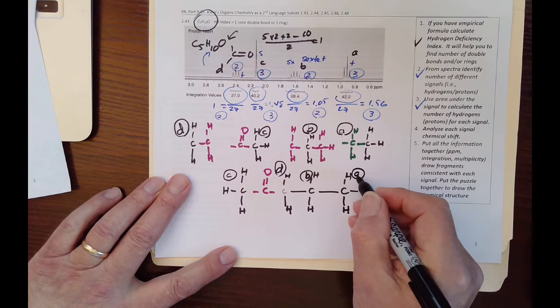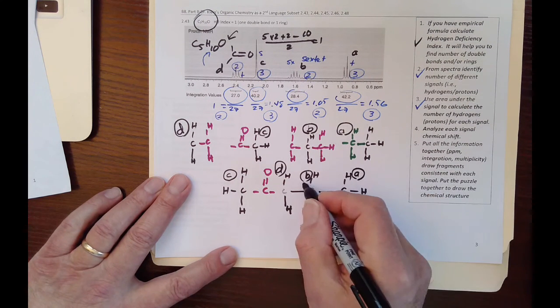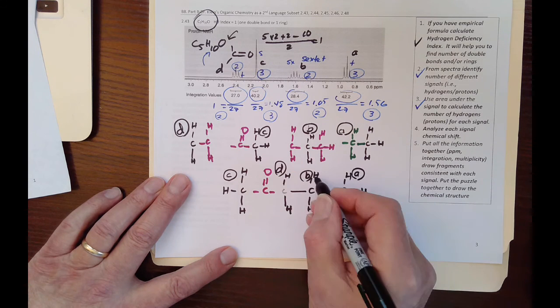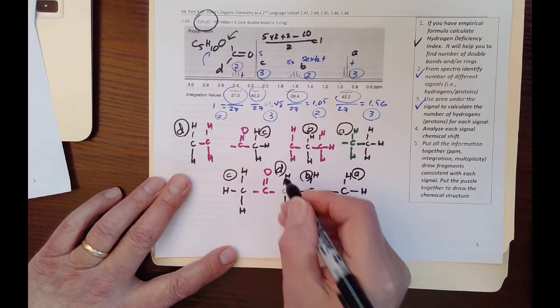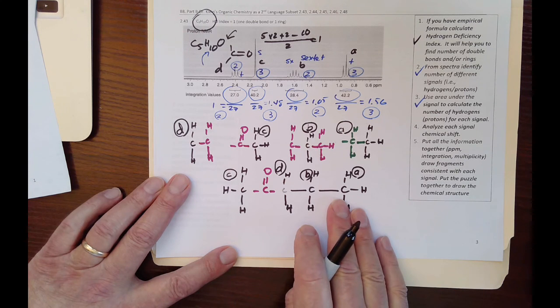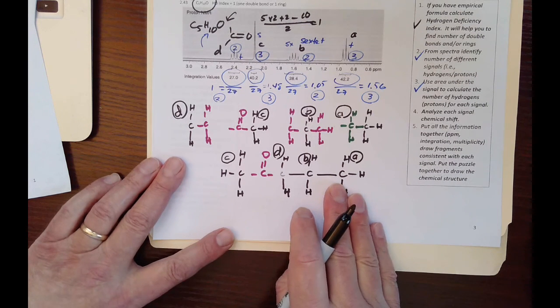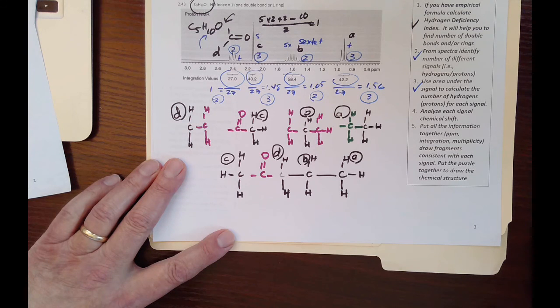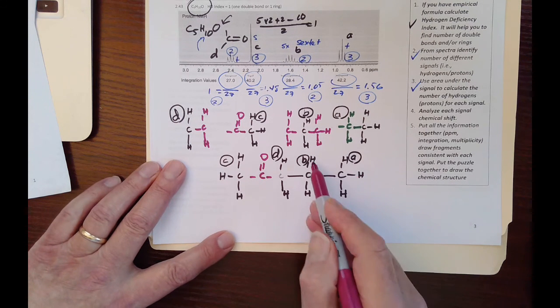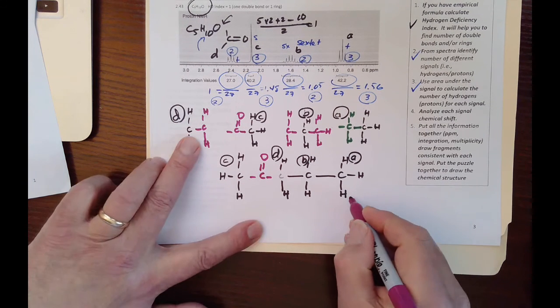So we have A, B, C, and D. And remember, this A, B, C, and D came from the spectrum, not from the structure. So we double check ourselves, always double check ourselves. We look at the A, next to 2 protons, so this would be a triplet.